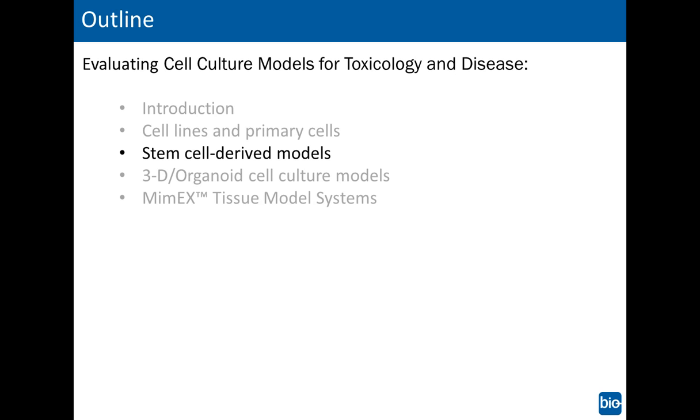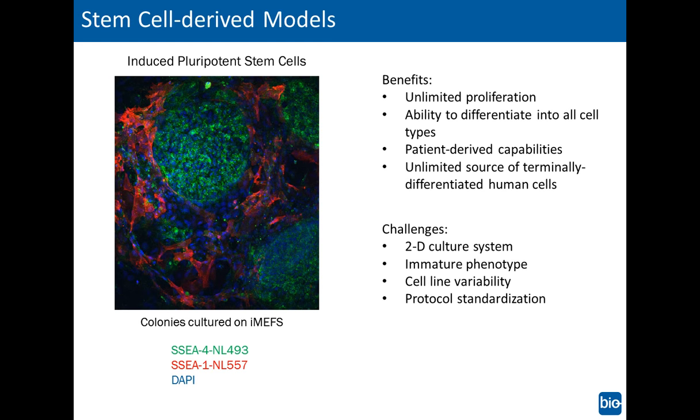Okay, like I said, that was going to be brief, and I'm going to spend the rest of the talk speaking about stem cell-derived models, which have become rapidly adopted in the fields of disease modeling and toxicology over the last decade or so. And so when I speak of stem cell-derived models, what I'm really referring to are models using induced pluripotent stem cells as a cell source. And so in the image here, we see a green induced pluripotent stem cell colony grown on mouse embryonic fibroblasts.